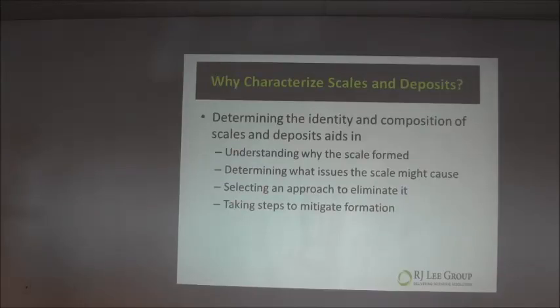Okay. So, why do we want to characterize scales and deposits? What customers that I work with see is that as they identify the type of scale and deposit they have, it gives them an understanding of why the scale formed. And if you can get an idea of why the scale is forming, then you can start getting a feel for, okay, what kind of issues might that particular scale cause as time goes on. And you can start looking at ways to eliminate it and steps you might take to mitigate formation in similar type instance or in that particular instance in the future.